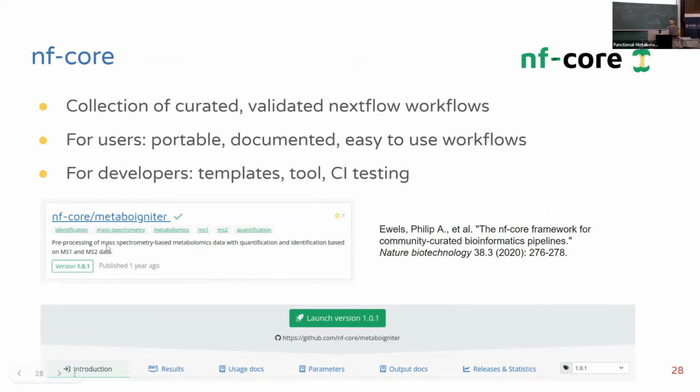And they have these nice overview cards, and when you launch them, you have very detailed instructions, great documentation, and so on. You could launch them directly there and also have a graphical user interface for your parameters. And if you set the parameters there, you could also copy the whole command into your system. For users, it's good because it's very portable, it's documented, and the workflows are easy to use. And for developers, they have nice templates, tools also for continuous integration testing. So the workflows fulfill a certain standard and are actually great.